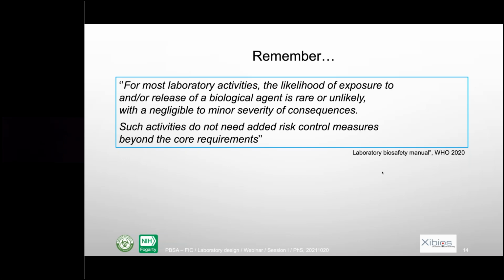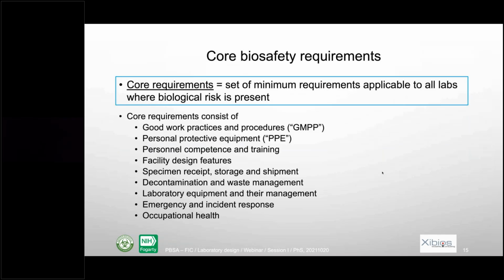So the core requirements are a set of minimum requirements that should be applied to all laboratories where there is some biological risk. According to WHO, the core requirements consist of a number of things, like good work practices and procedures, personal protective equipment, personnel competence and training, and WHO insists on this one because it's really something which is extremely important.